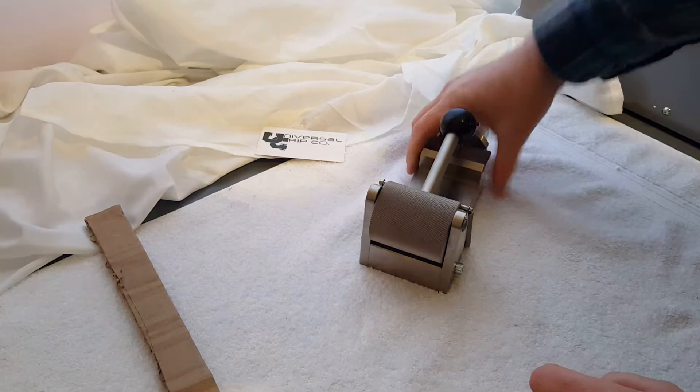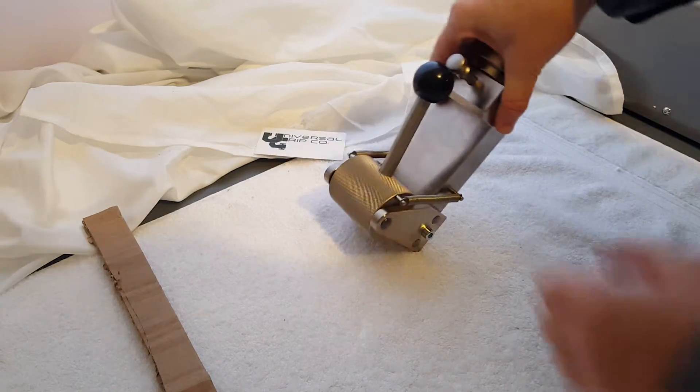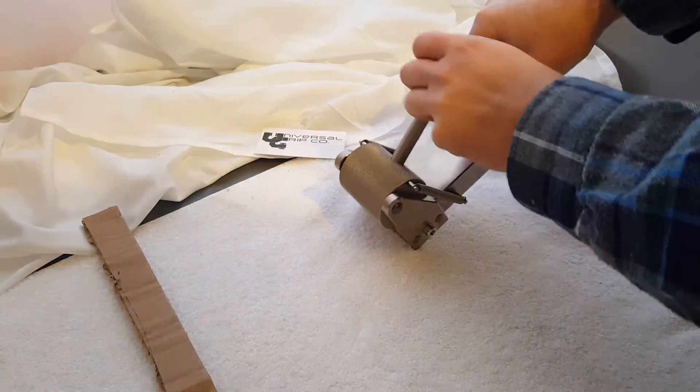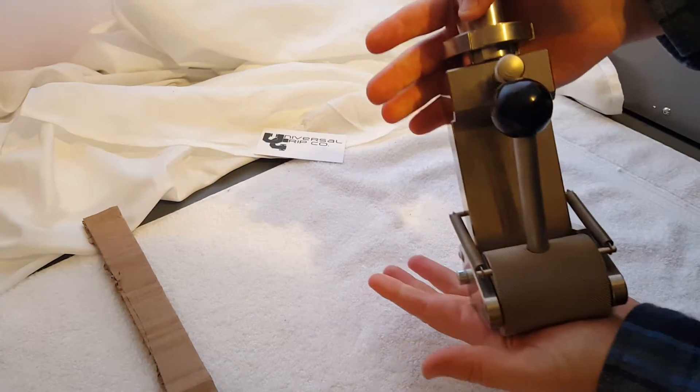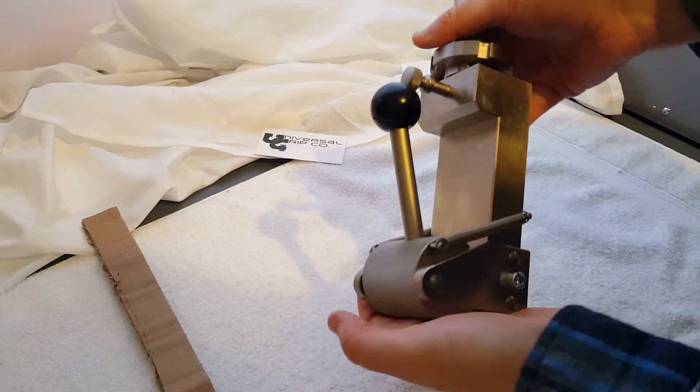This is a great all-around grip. It's easy to use — it's a quick mechanism to insert samples, which is why a lot of people like it. This one is rated to 10kN again, a little over 2,000 pounds.